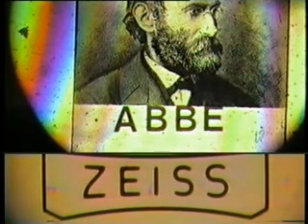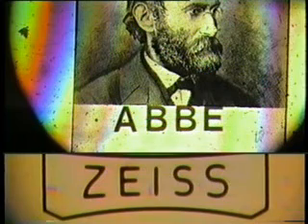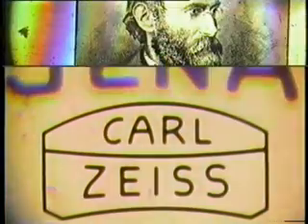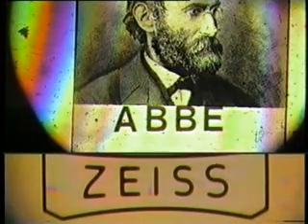My microscope is fitted with two video cameras, one showing you the back focal plane of the objective, which appears at the top of the screen, and the other showing you the final image plane, which occurs at the bottom of the screen. And as you see, I can wipe between the two, showing you more of one and less of the other as appropriate.